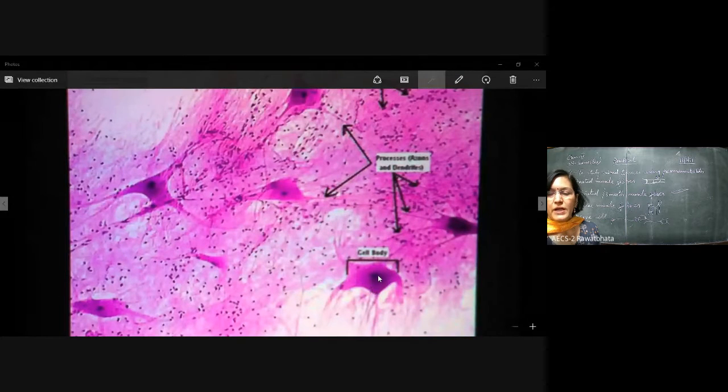The cell body and its processes. This cell body and its processes, these are like dendrites coming out. All dendrites coming out. And these dendrites are joining with the axons of the other cells. Same happens with this one. This is also sending to some other cell, and here its tail, you can say, goes and connects with the other cell.